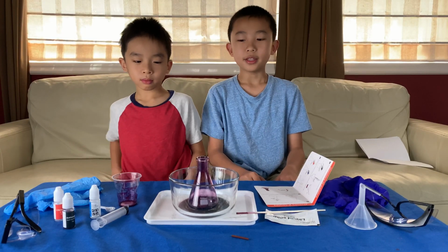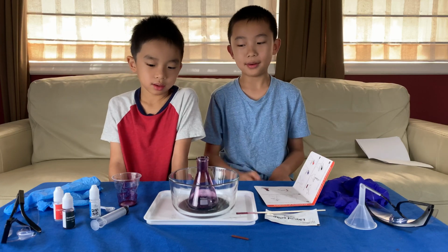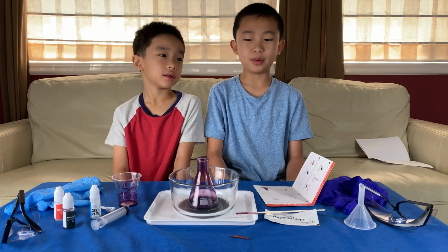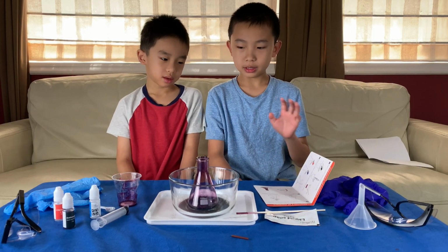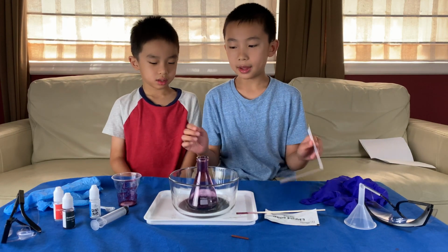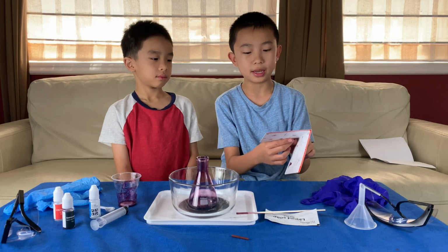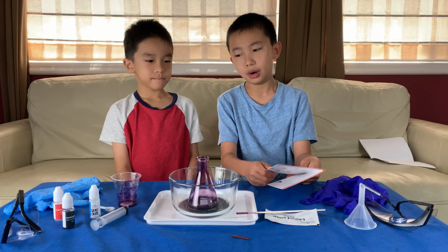The eruption is all gone now, and that didn't take 10 years like brother thought. It took maybe a good 15 or so minutes before it finally stopped. So yeah, we're all done with this one. And now we have to dispose of the project. In the instructions it says dispose of solid waste together with household garbage. Pour the solutions down the sink and wash with an excess of water.